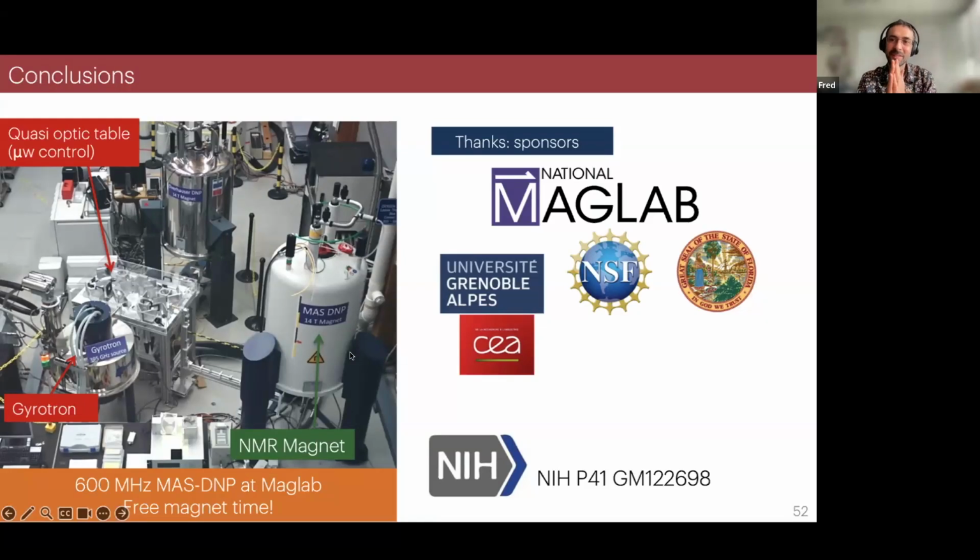Okay, there are different aspects. First, you can know what's your actual radical concentration. So it gives you an idea of if you have enough proton to radical ratio in your sample. So if you have a very weak SNR in your EPR, most likely you don't have enough radical in your medium to carry out good DNP. Now you can look also at the mobility of a radical.